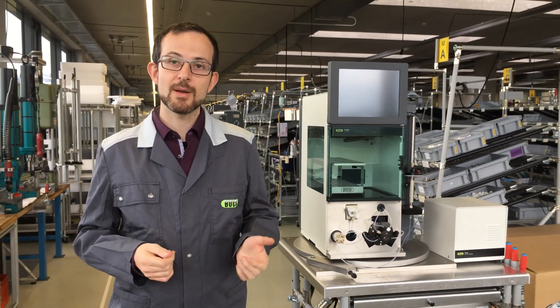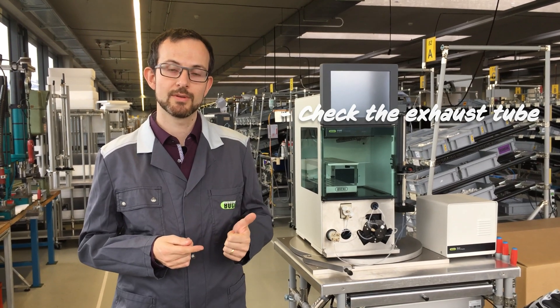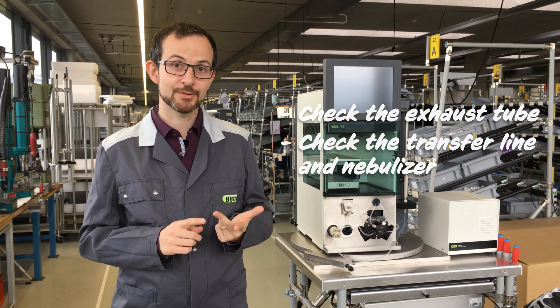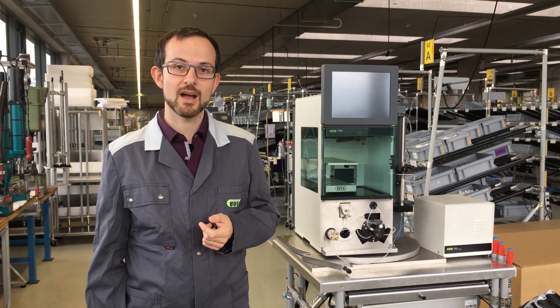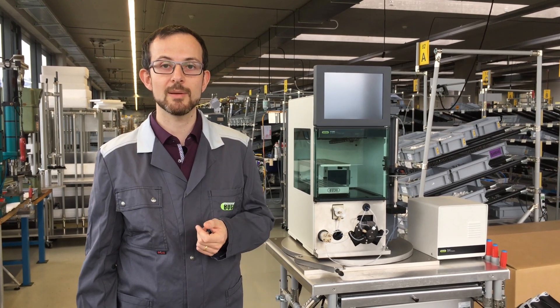Now let's wrap up. The first check you can do is the exhaust tube. Check 2 is the transfer line and the nebulizer. And check 3 is the carrier gas. Now let's go to our application specialist up in the lab and talk with him about problems that could be caused by the application.